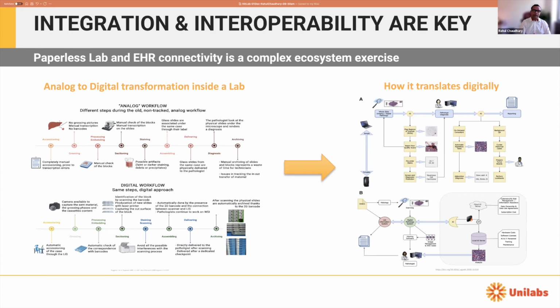And if you extrapolate it then to the healthcare systems, we understand the complexity of the digital transformation in the lab diagnostic space. Because on the right-hand side, what you see are the data models that actually look after the transformation as it happens, right? So that's, again, the whole journey. I'm not going to go into that, but suffice to say that it turns a manual process into a paperless lab, and then you have electronic health record connectivity across the ecosystem, which in itself is a complex exercise.